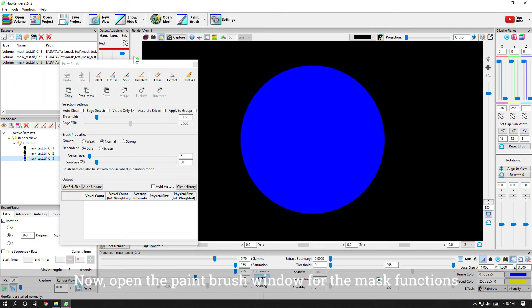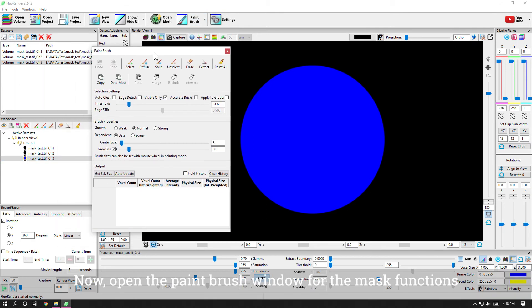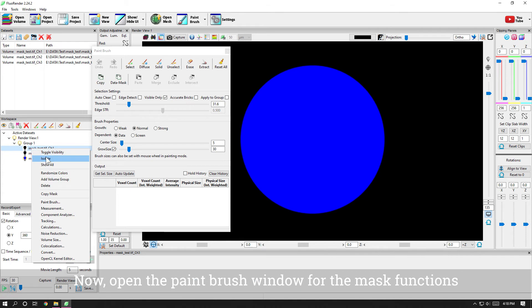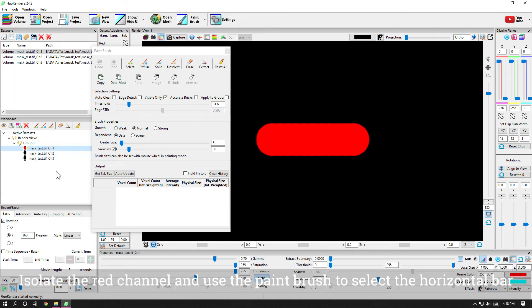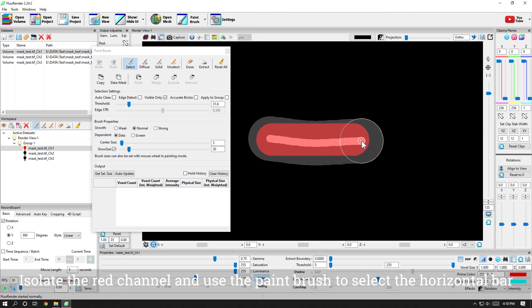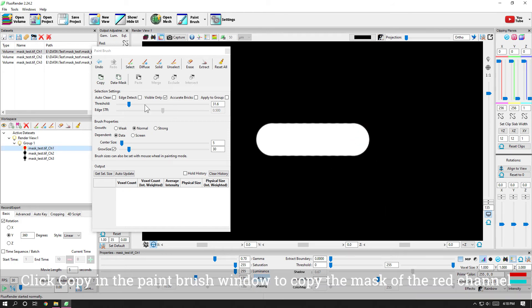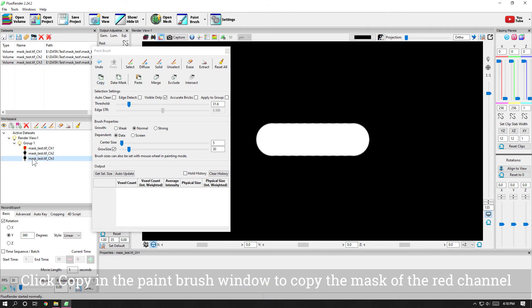Now, open the paintbrush window for the mask functions. Isolate the red channel and use the paintbrush to select the horizontal bar. Click copy in the paintbrush window to copy the mask of the red channel.